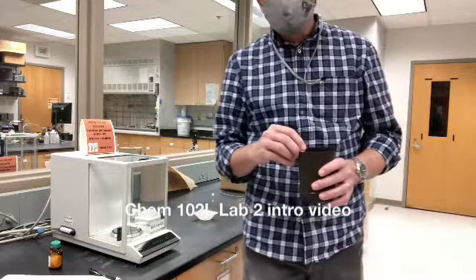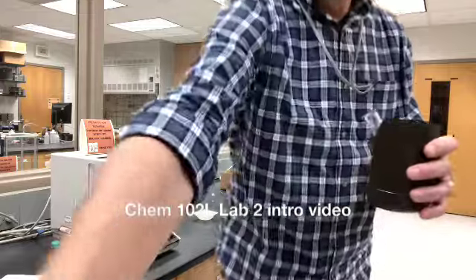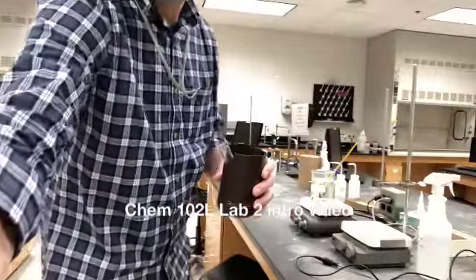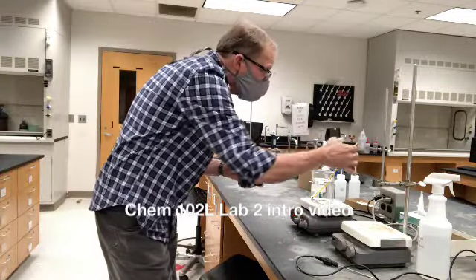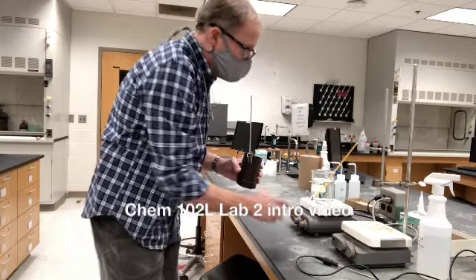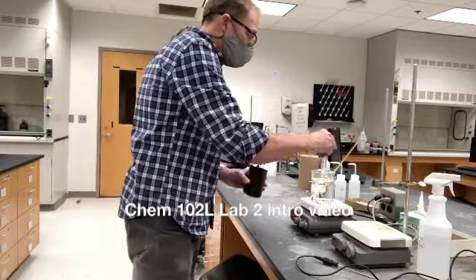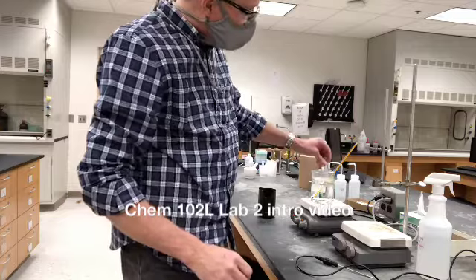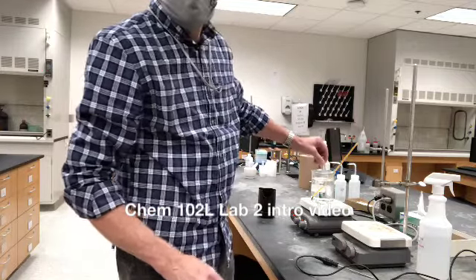So now I'm going to show you that we can melt this easily. We are going to have in the lab a beaker of hot water, and this one I have a thermometer which shows me it's at a little over 60, and right now I have the setting of the heater at just between 3 and 4. I'm going to put this test tube in here, and this water is now warm enough that it's going to melt this lauric acid.